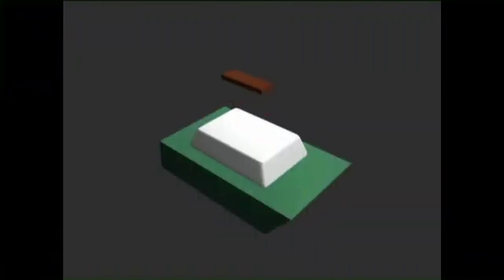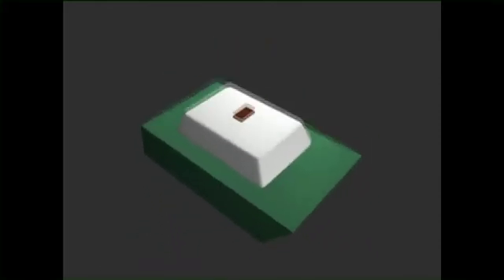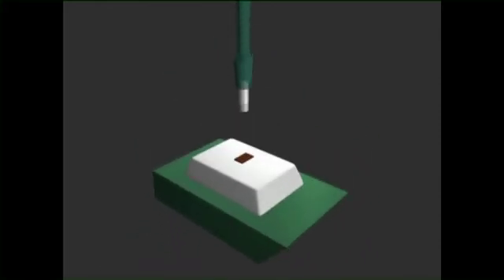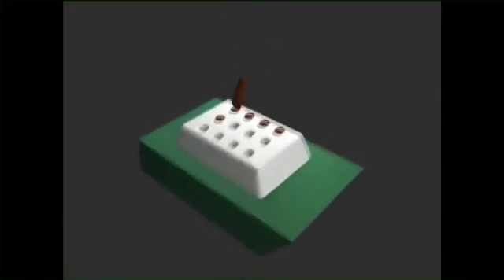Let's do a quick recap. Remove the selected sample from the donor block. Cut it into usable sizes. Stand it on end. Re-embed them into a new block. Once the block is cooled and at room temperature, punch the block with the needle you are using for your TMA — in this case, the 3.5 millimeter needle — and then add the perpendicular embedded core to your TMA.